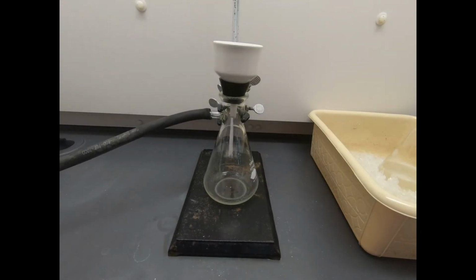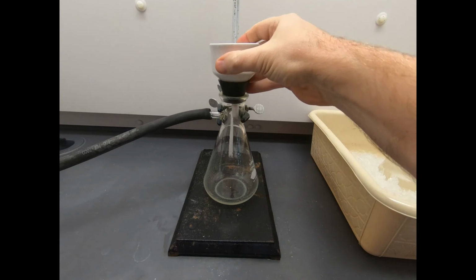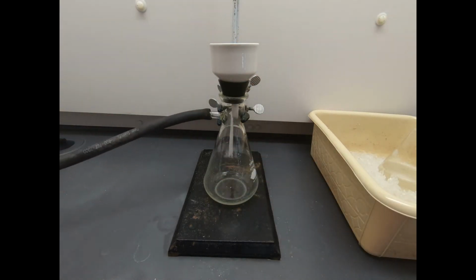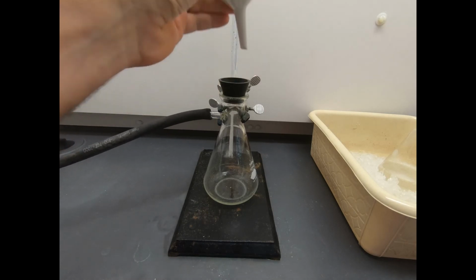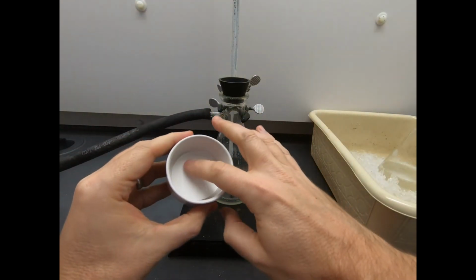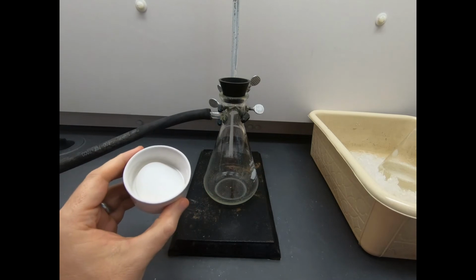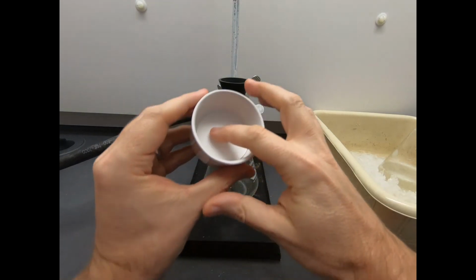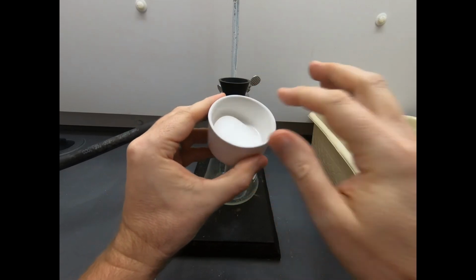Now, we want the solid, we don't want the liquid. So therefore, we're using a Buchner funnel, suction filtration. We have a sidearm Erlenmeyer flask. We have this connected to our house vacuum line. We have a Buchner funnel, and we have a filter paper in here. Now, our solution that we're filtering is essentially water. So we're going to use water to seat this filter paper and get it in place.